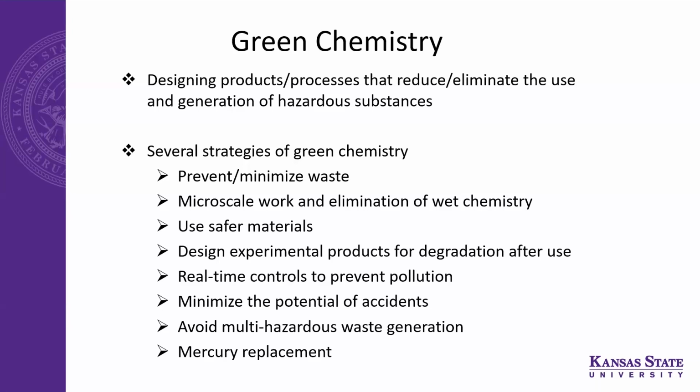I don't think we use any mercury in our labs anymore, but if there are ways to avoid that, then replace the mercury too. For example, some labs may still have the old mercury thermometers. Stop doing those. Yeah, absolutely. That's a good question on what do you have with mercury right now? I know they make some alternatives depending on what you're doing, and the green options are better, obviously.